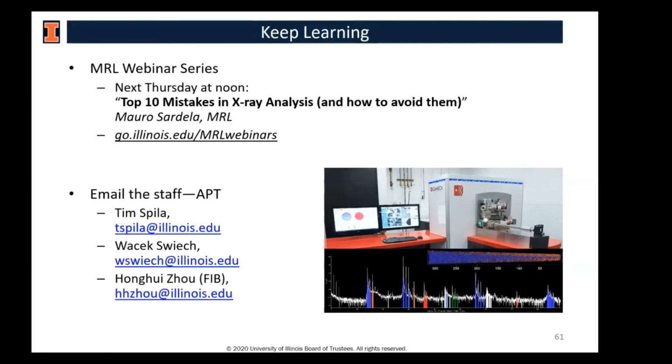Okay. One more question is about sample damage that can occur during this process. Does it change chemical composition and quantification? I mean, the inherent feature of the method is that you're consuming the sample. So the sample, like in the SIMS process, is being evaporated away. In the end, you have a much shorter tip than you started with. Everything that has been field evaporated has been field evaporated, and there is nothing left over.